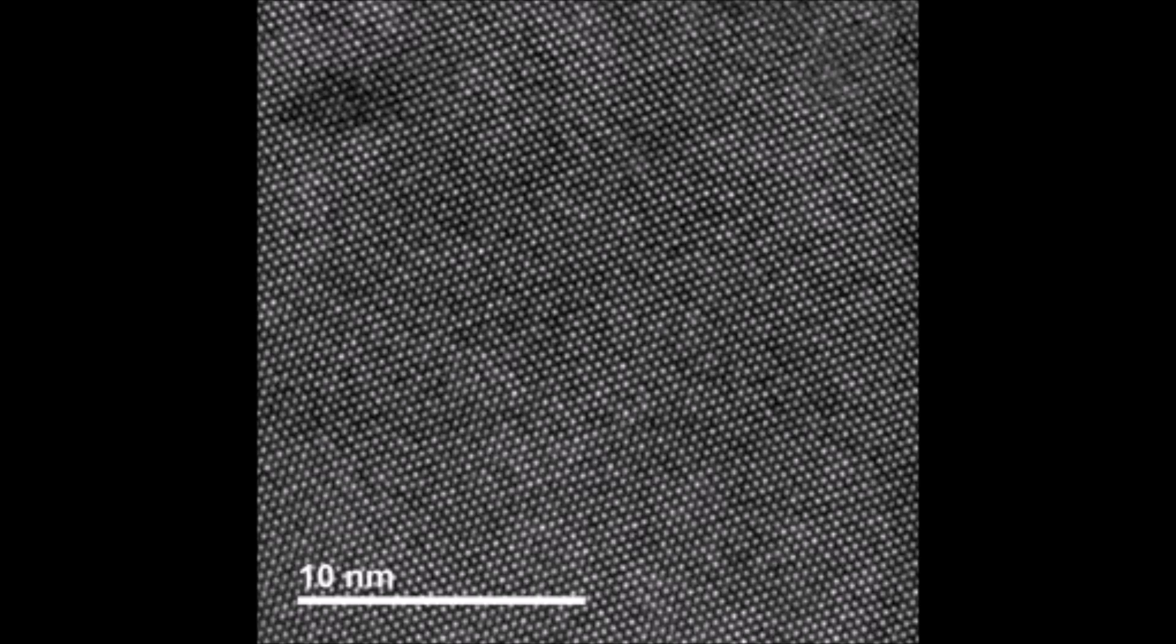So in this instance, I have a silicon sample and I'm aligned to a 110 zone axis. And I can see a lot of detail in the high resolution image because I am well aligned with the zone axis.